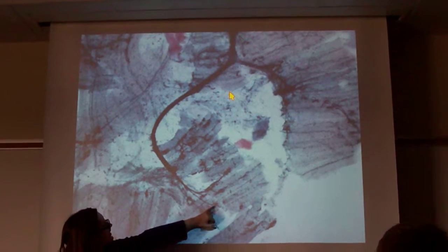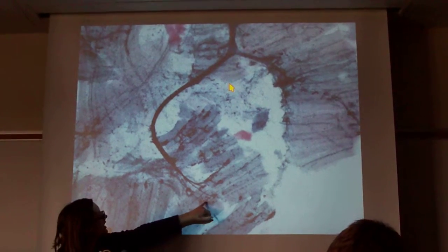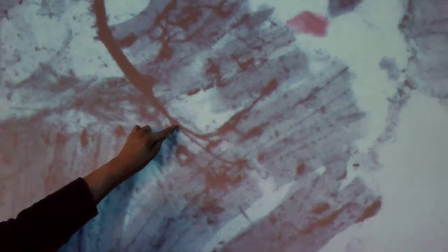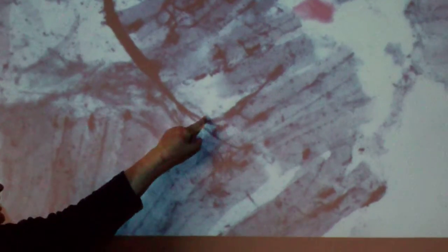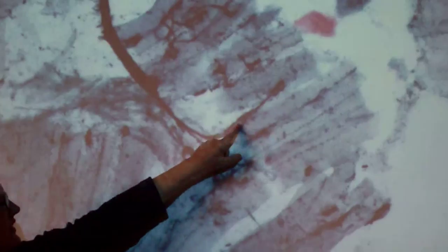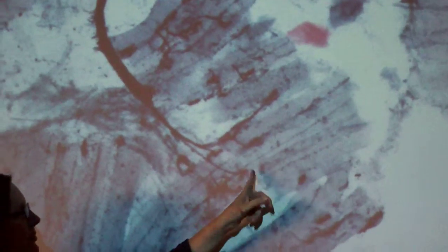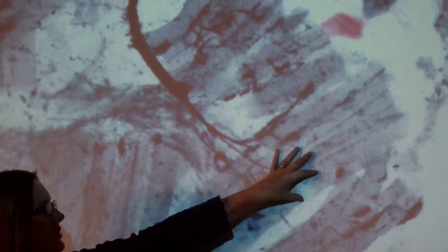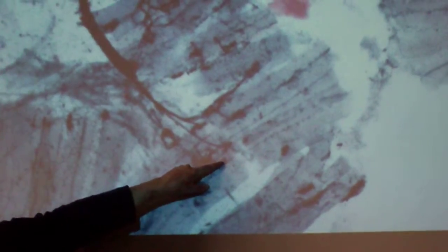All of these little black blobs at the end, all of these are synaptic terminals. So what's happening is here's our main axon branch coming down. It's going to branch into the little branches, and then at the end of each one there's going to be a little blob which is going to sit down. This is reptilian muscle tissue. So you can see all the muscle fibers are running in this direction, and this is talking to this one, and this is talking to that one, and that's going to talk to the next one over there. Okay, so that's what the synaptic terminals actually look like.